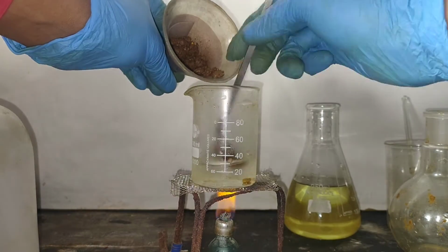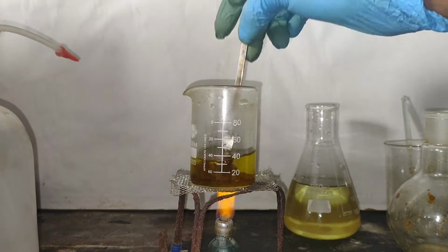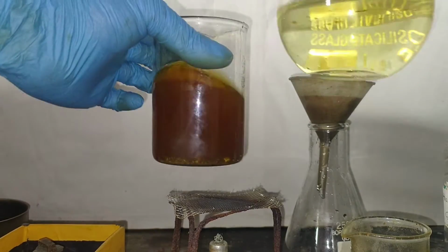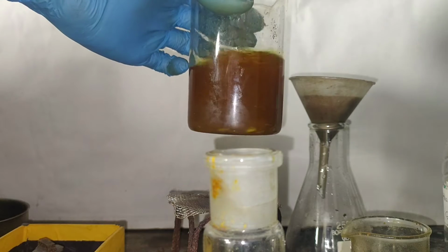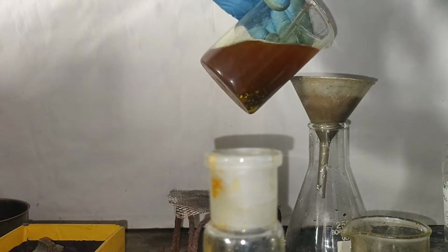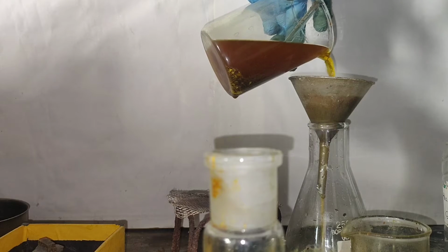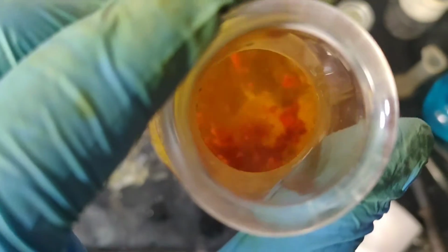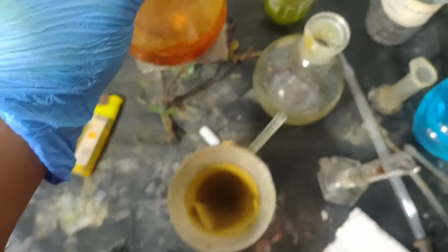and dissolved in 95% ethanol. I heated a small amount of ethanol and to it I added alpha-nitronaphthalene. Then I added more ethanol. The ethanol was in excess, so I transferred the solution into a bigger beaker and then filtered the solution while hot through gravity filtration. Some solid is precipitating in the conical flask. So I placed the conical flask on a spirit lamp and started heating it.